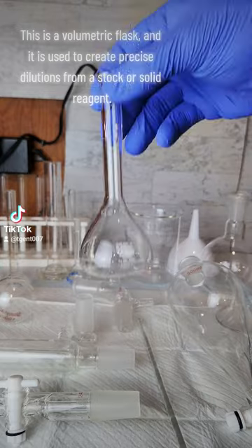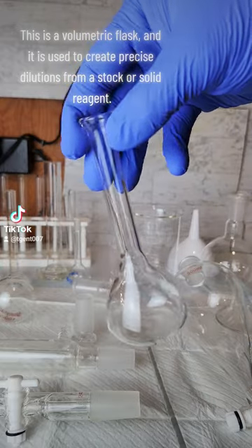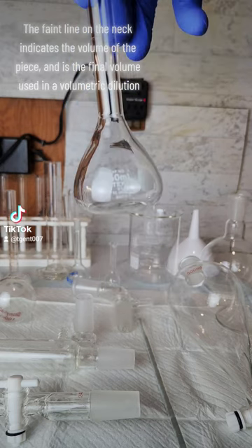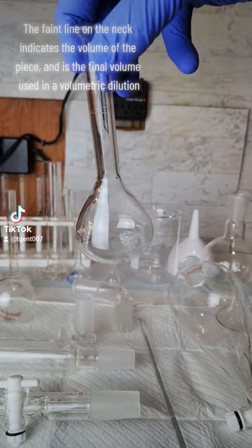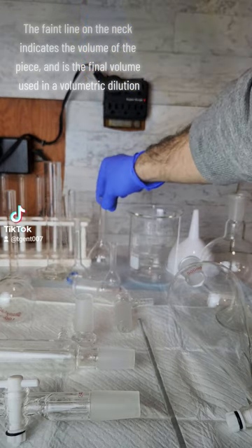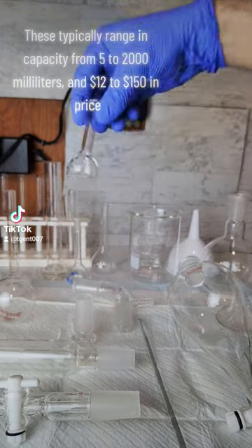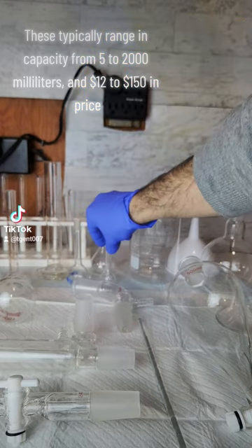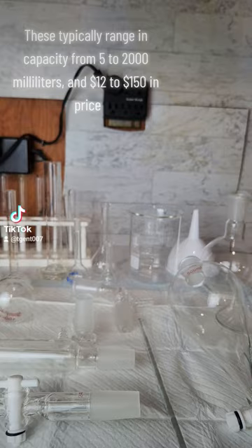This is a volumetric flask and it is used to create precise dilutions from a stock or solid reagent. The faint line on the neck indicates the volume of the piece and is the final volume used in a volumetric dilution. These typically range in capacity from 5 to 2,000 milliliters and $12 to $150 in price.